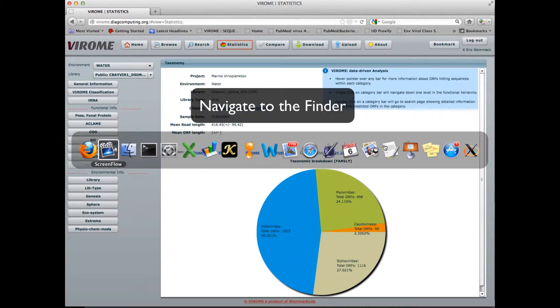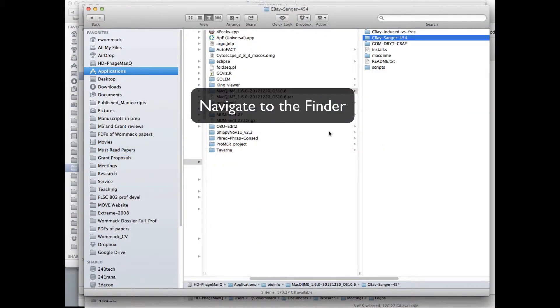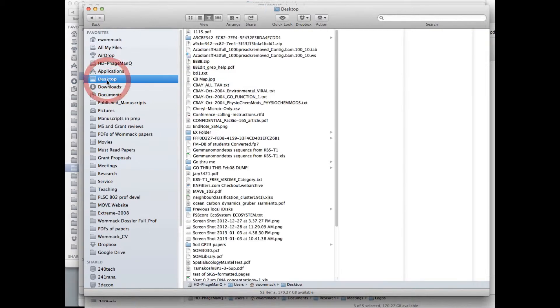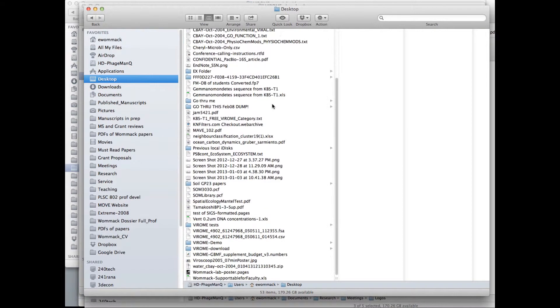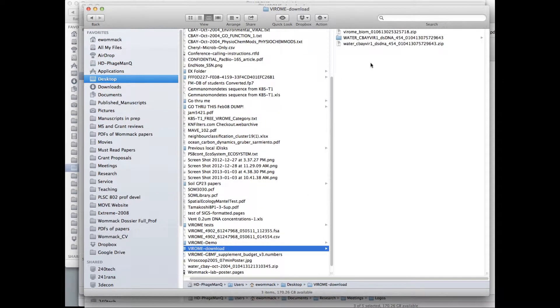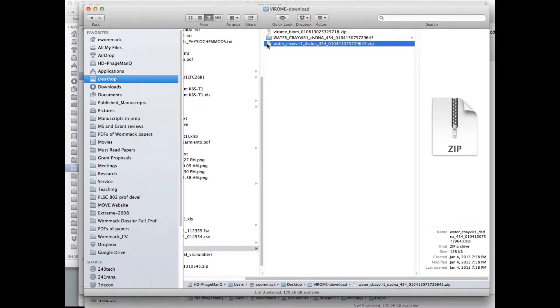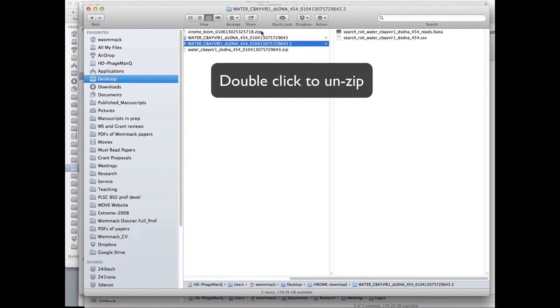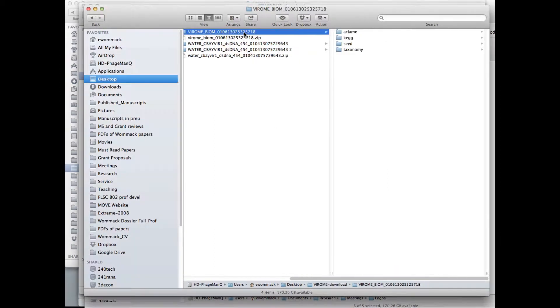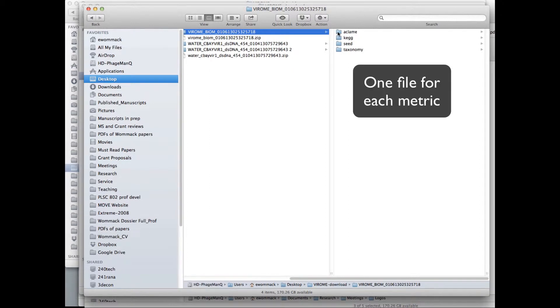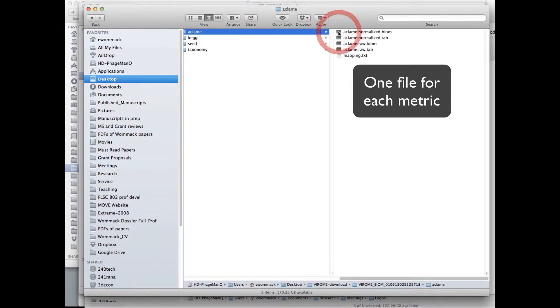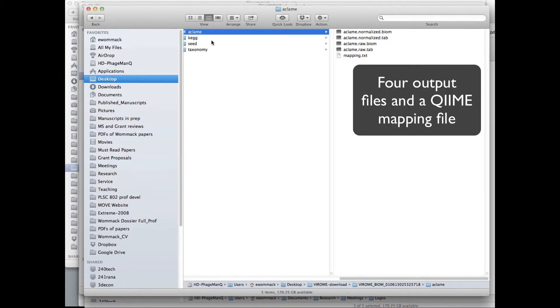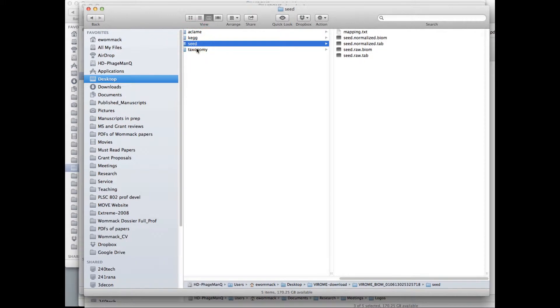Then I'll go navigate to the finder, open the folder, and there I see my comparison files. I double click the file to unzip the file. And here you see I have a file for claim with four files and a mapping file that's used for CHIME analysis. And each of the folders is organized in this way.